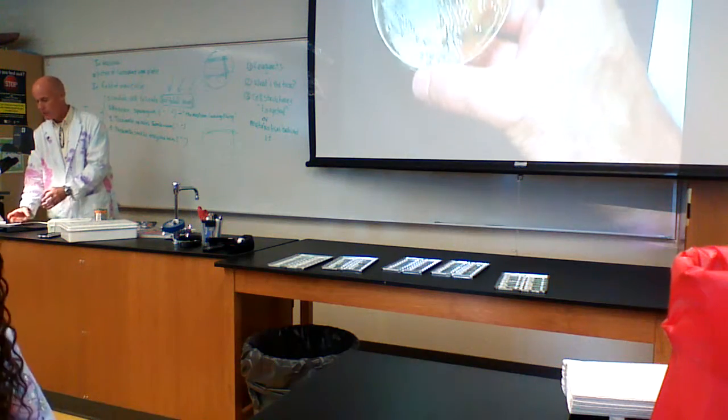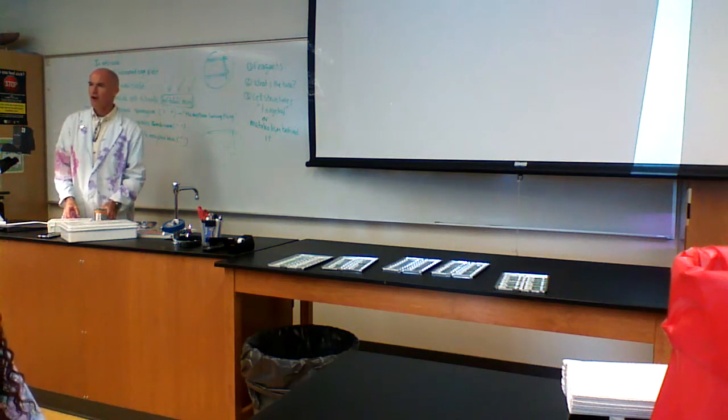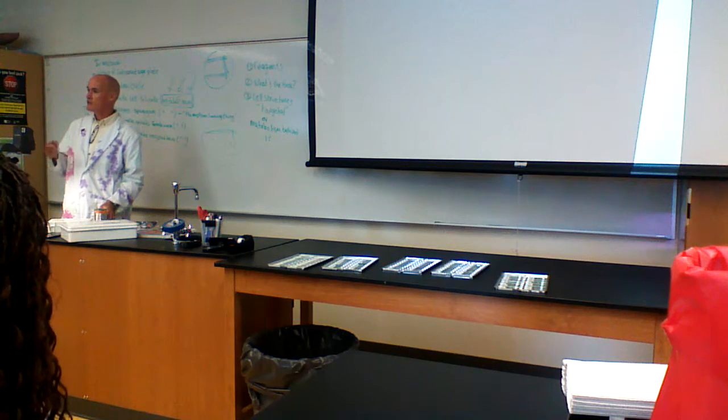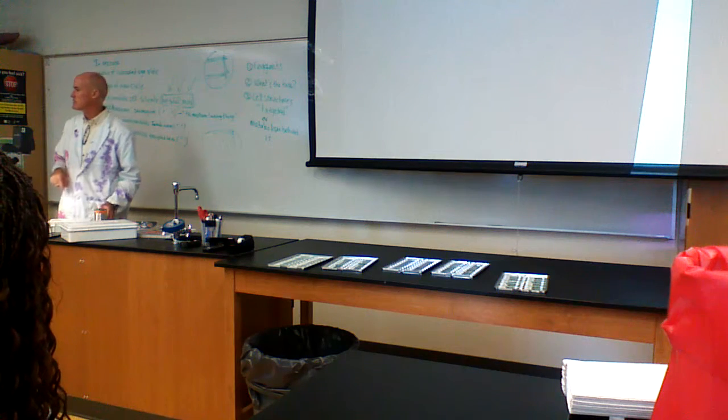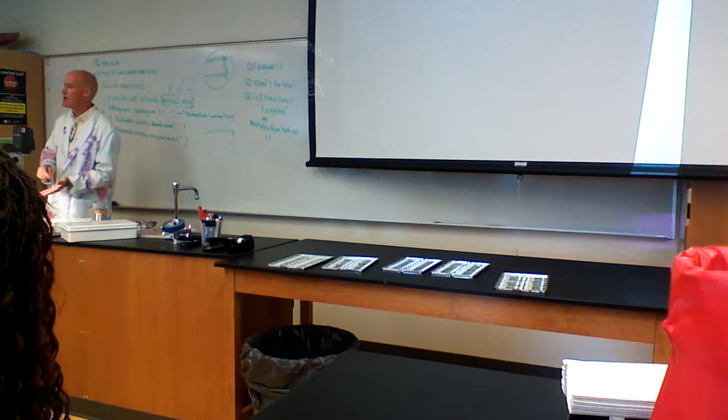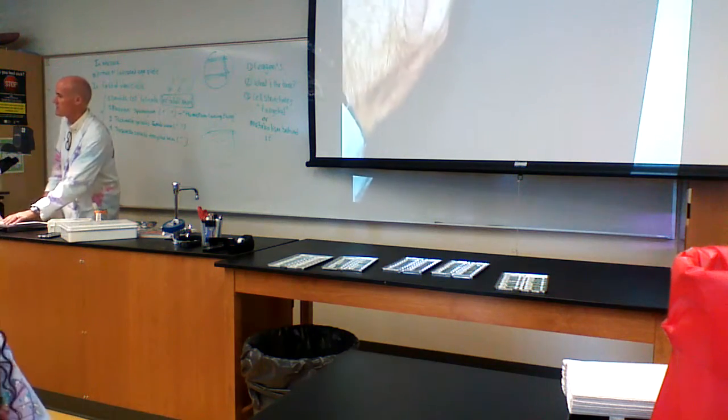So I don't know what that is. Fungi are like hairy fuzzy. All fungi are hairy, but some fungi are single cell and will grow in colonies. They don't make hairs. So I don't know what the non-hairy one is. I don't know what that is. I would need to stain it.